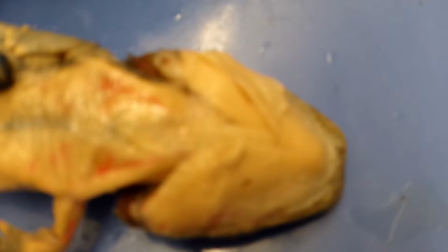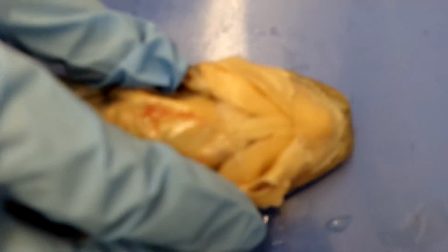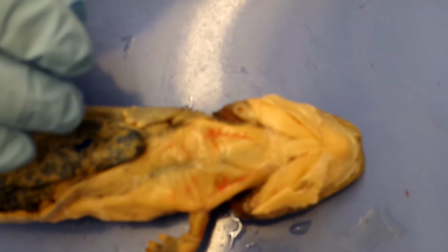The last muscle in this section is the geniohyoid, which is found right here, these two sections right here. Its origin is the mandible, its insertion is the second basibranchial cartilage, and it is homologous to the coracomandibular in the shark.